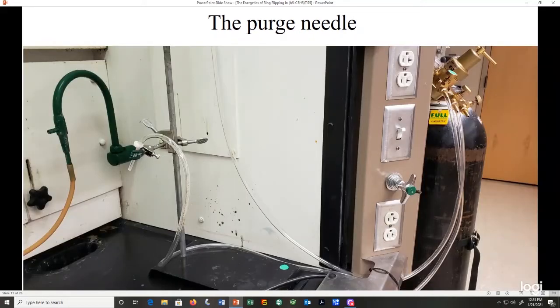So the purge needle is going to be used to purge our bottle of superhydride with nitrogen gas to make sure we don't have any oxygen in that headspace. And it's also necessary to create just a little bit of overpressure when we're getting our superhydride out of the bottle.